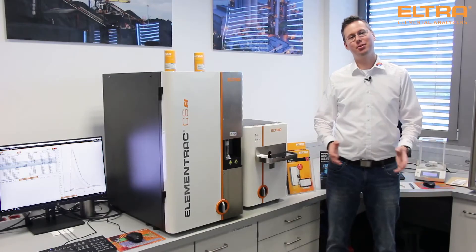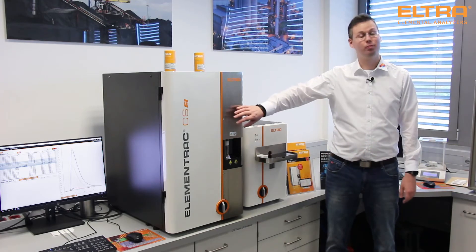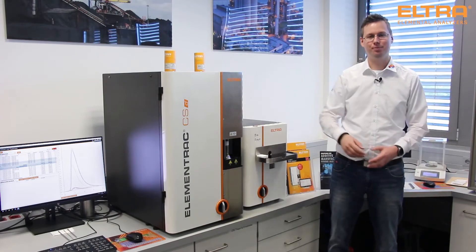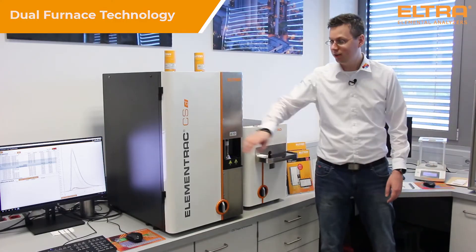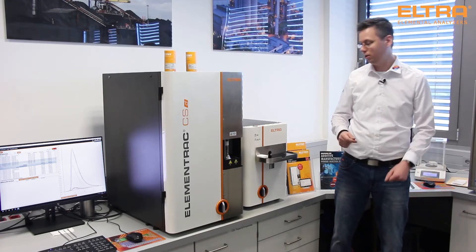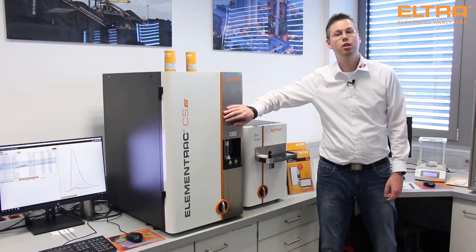Hello, my name is Mike Lucca. I'm a project manager at Eltra, and in this video I want to introduce you to our new carbon and sulfur analyzer, the Elementrac CSD. This unique combustion analyzer combines an induction and a resistance furnace for simultaneous detection of carbon and sulfur in organic materials like coal and inorganic materials like metals.